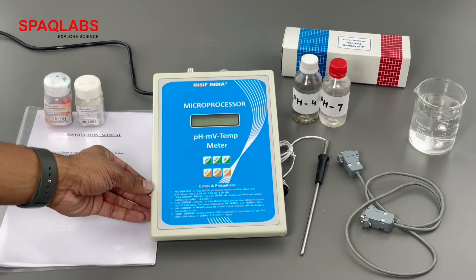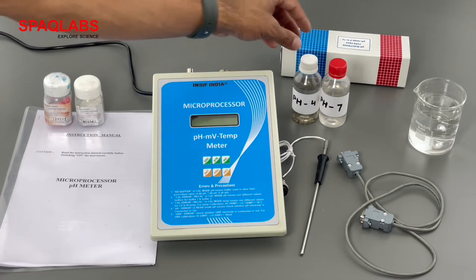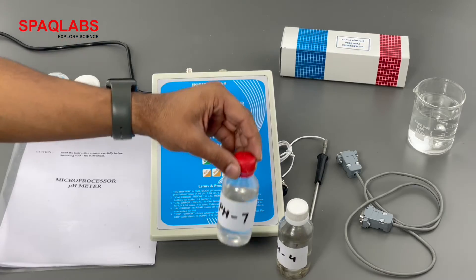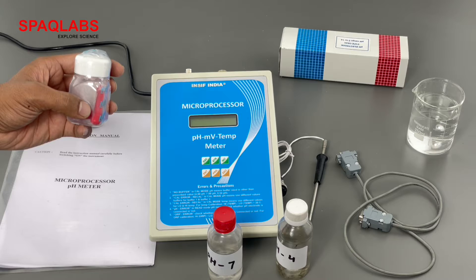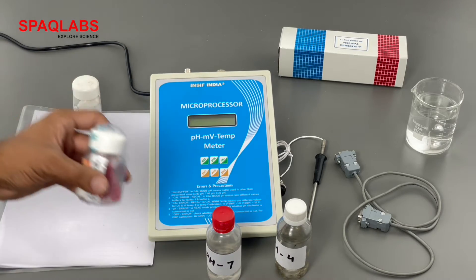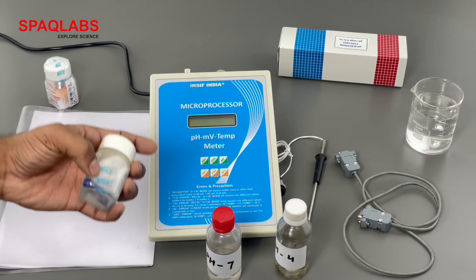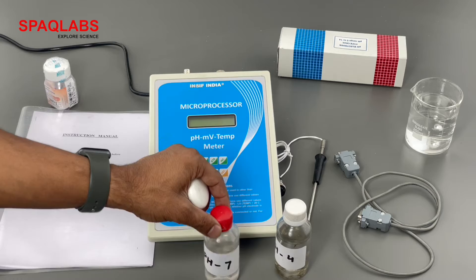This is the microprocessor pH meter and these are the prepared samples, buffer solutions for pH 4 and pH 7. These are prepared from capsules. One capsule is dissolved in 100 ml of distilled water for pH 4, and another capsule is dissolved in 100 ml of distilled water to prepare the pH 7 buffer.